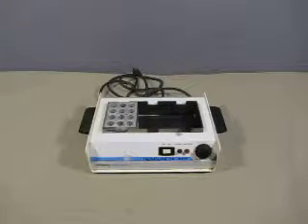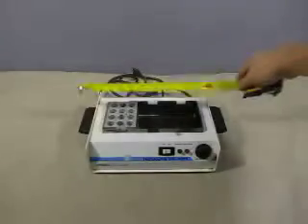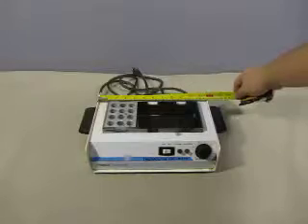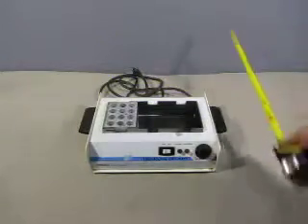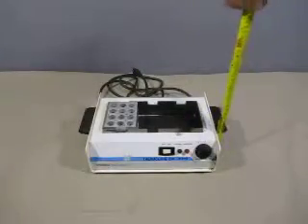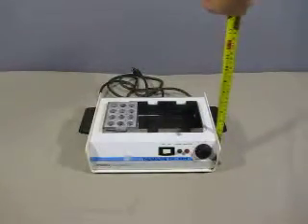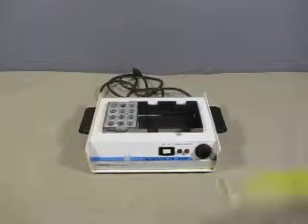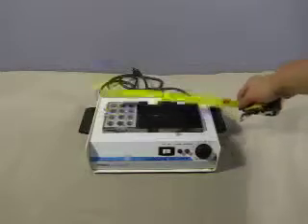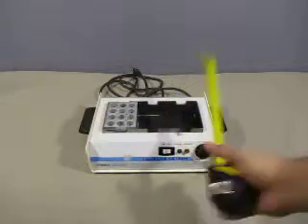Up for auction we have one used Cybron Thermaline Dry Bath. The unit itself measures just 30 centimeters, or just under a foot, 9 inches wide, and stands approximately 4 inches tall. The bath area itself is 9 and a quarter inches by 4 and a half inches.